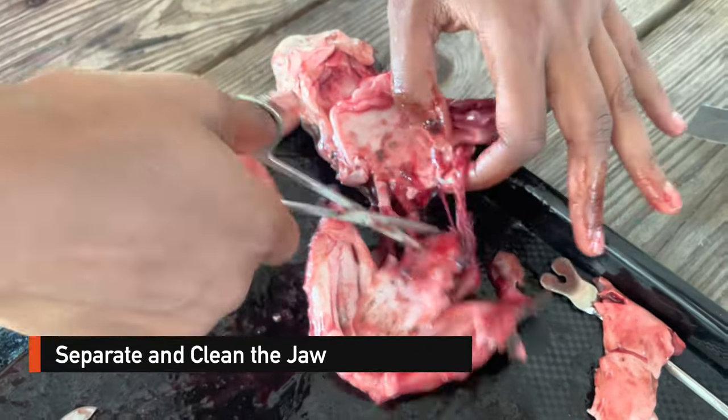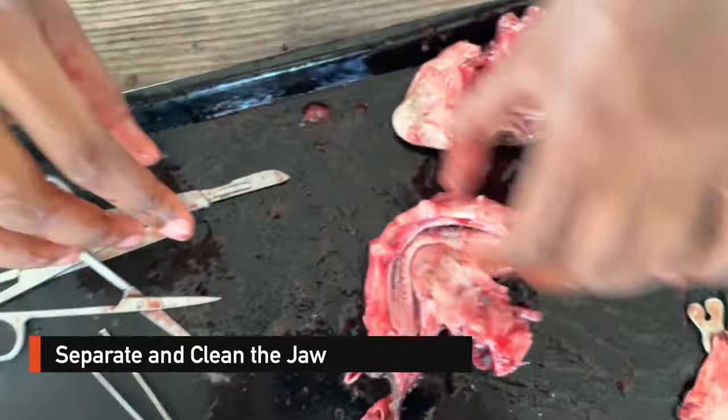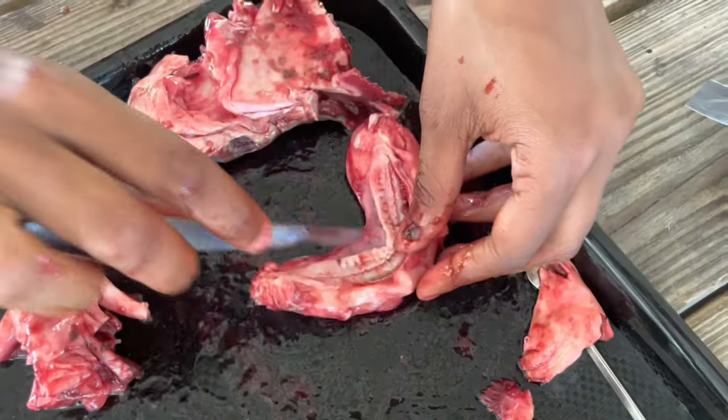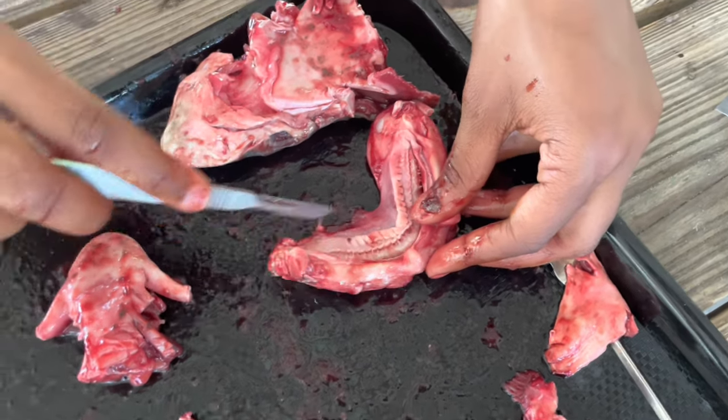I found that the scissors and scalpel were my best friends during this process. At this point I started scraping and trying to get as much of the gums off the jaw as I could of the male shark.